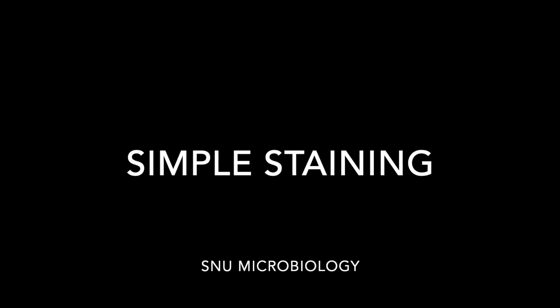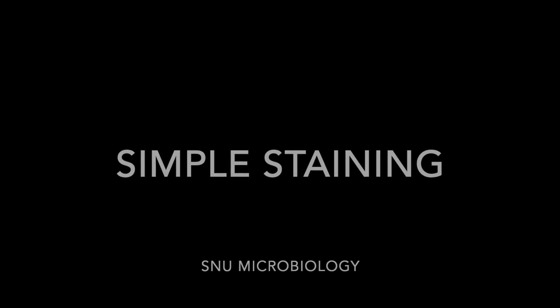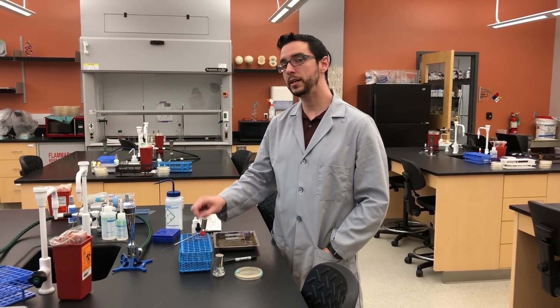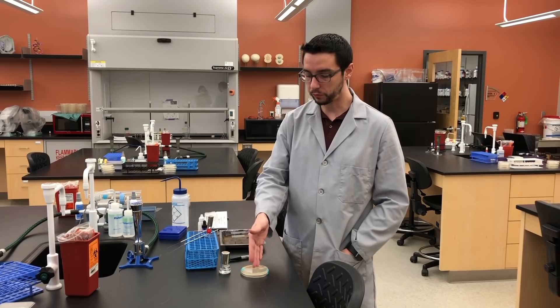Welcome to this microbiology video where we are going to walk through the process of simple staining coming from both an agar plate and a broth culture. The first thing you're going to notice that's different is that we're going to employ a needle probe when we are collecting our culture from the plate.